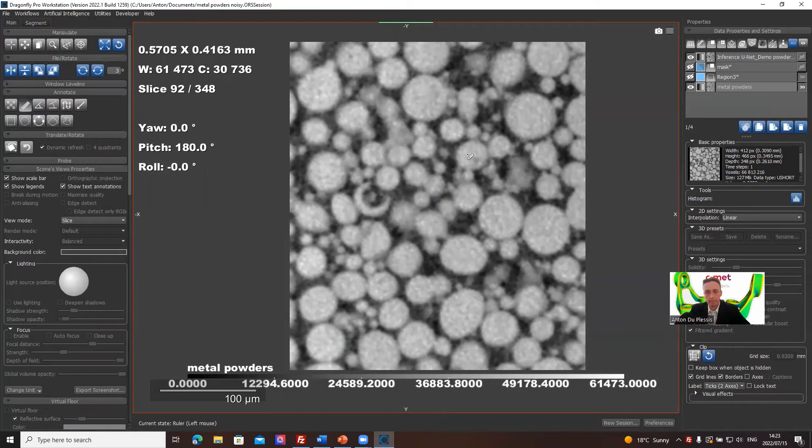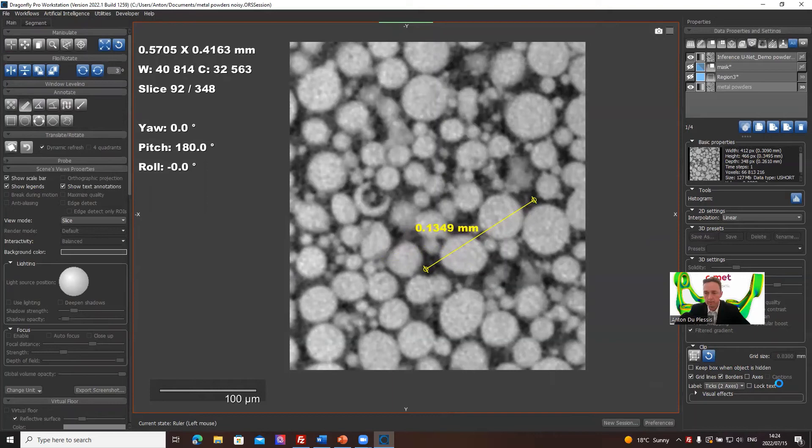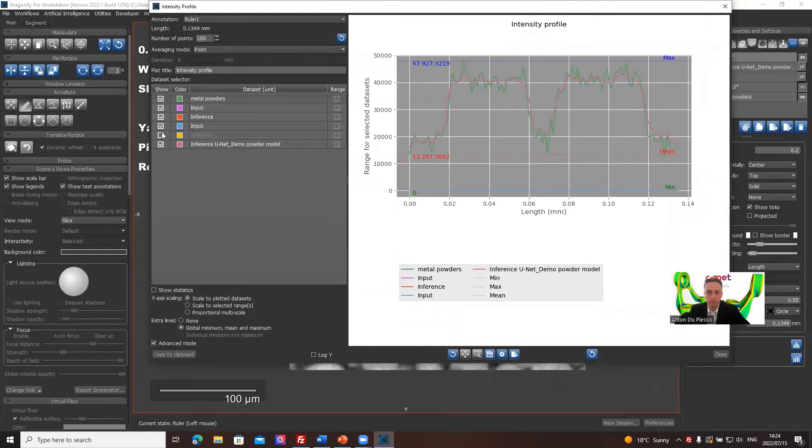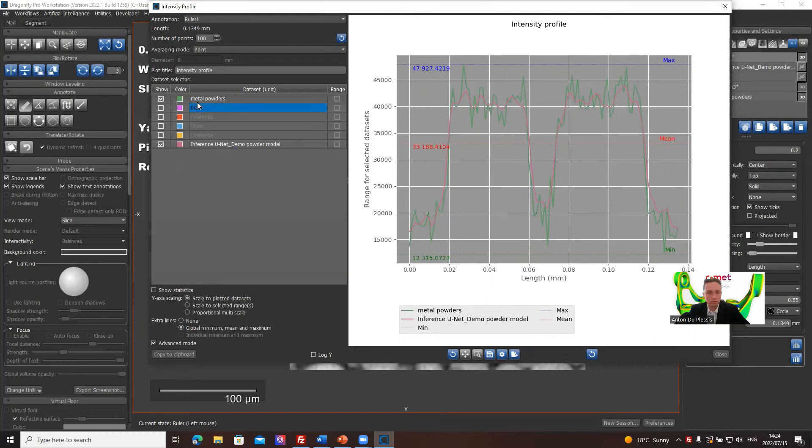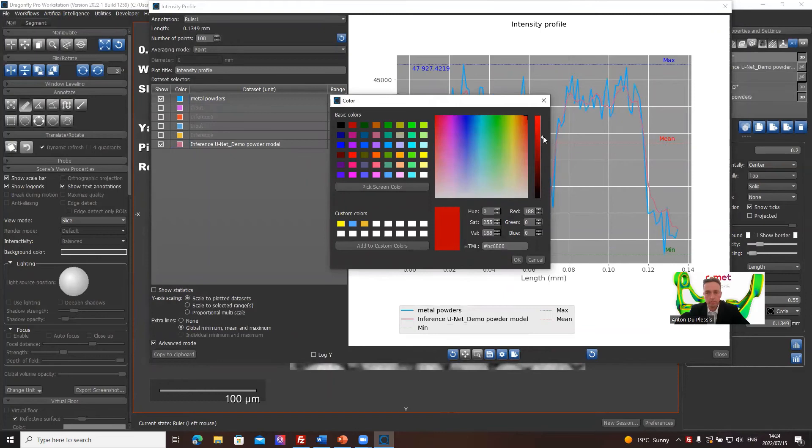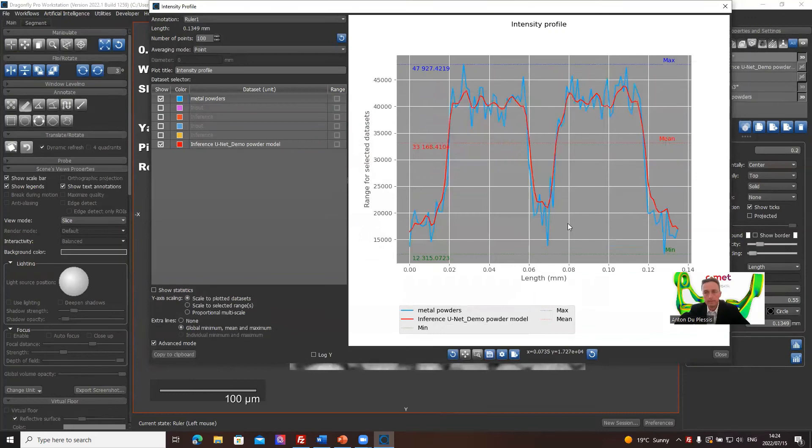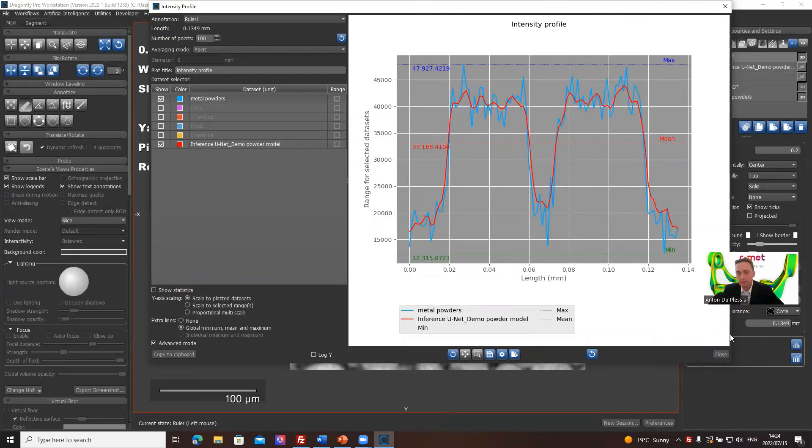If we look at, let's say, across this region here, let's say we go across a powder particle or across two powder particles like that, we can do a profile intensity. We can put a lot of these things off. We're only interested in the original and the final result which is, the green is the original. It's not so clear here. Let's just make that maybe brighter blue on the original and on the inference we make it red. This is maybe a brighter red. The denoised model is looking like that. That is a very nice result.